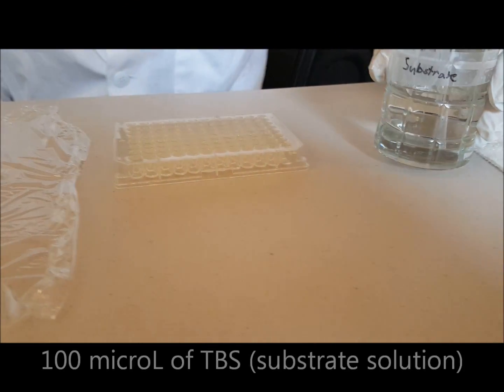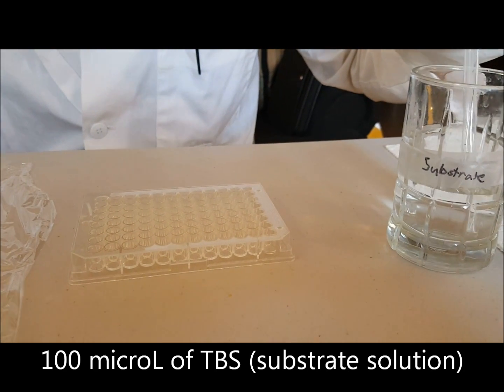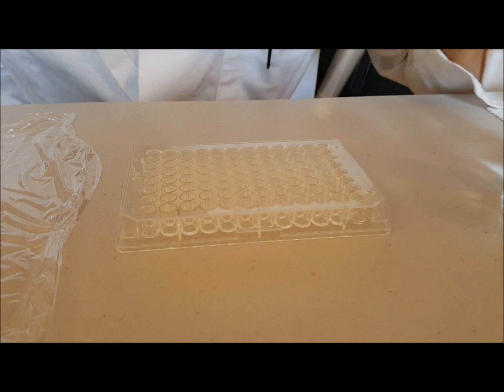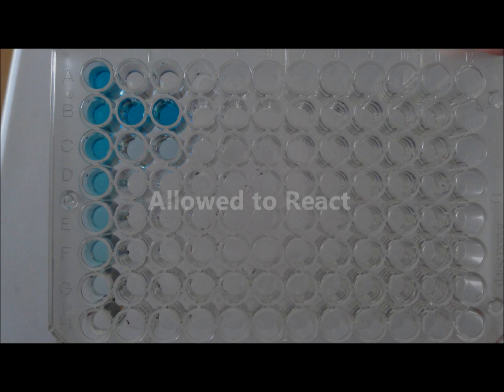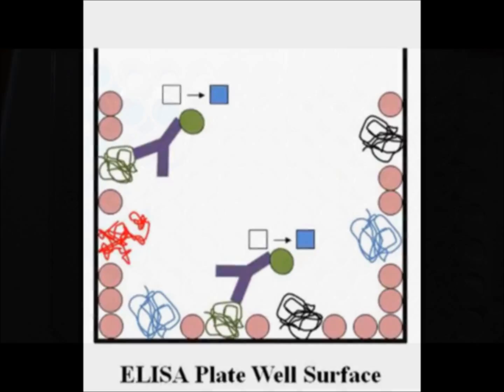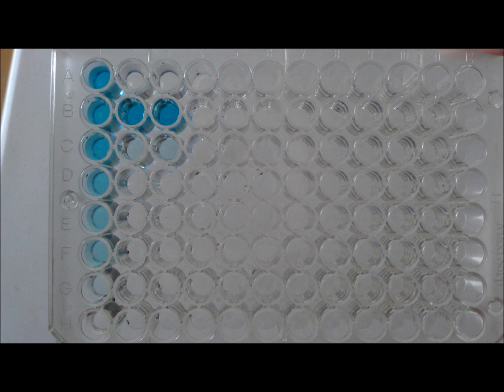Next, 100 microliters of a solution containing substrate to those attached enzymes mentioned earlier is added in. As the plate sits, a blue color is formed. This process causes the colorless substrate to complex with the enzyme which produces an overall blue color. The more blue color there is, the more the target antigen is present.